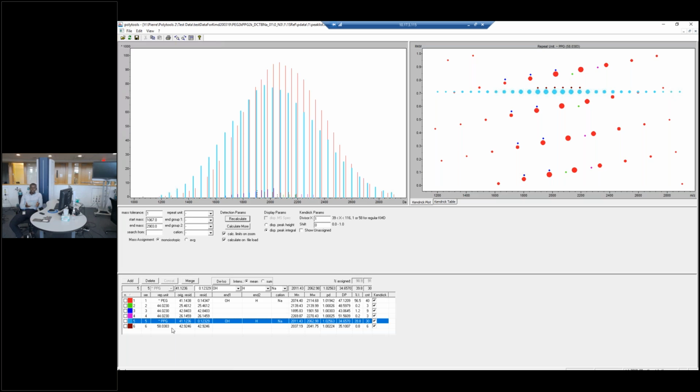And also, if you have a surface and it's taped on there, you can easily remove it. I've used the same target for very long periods of time and barely had any chipping or any changes to how the surface of the target looks. You would have to put some effort and energy into it to be able to chip the target. Hopefully that answers the question. Thank you.